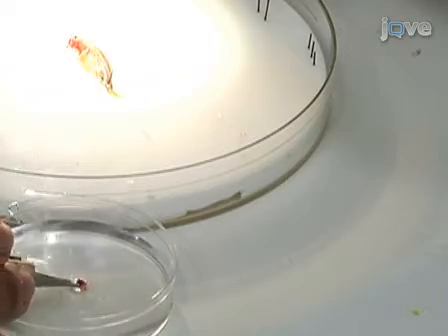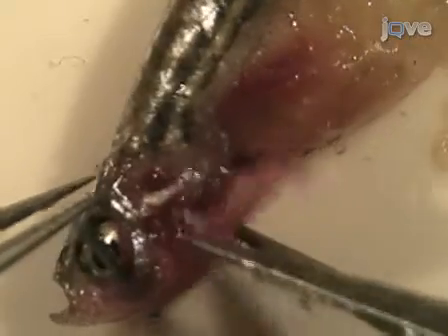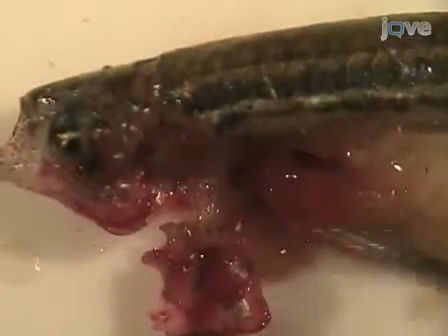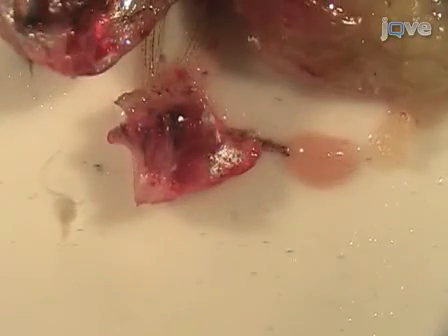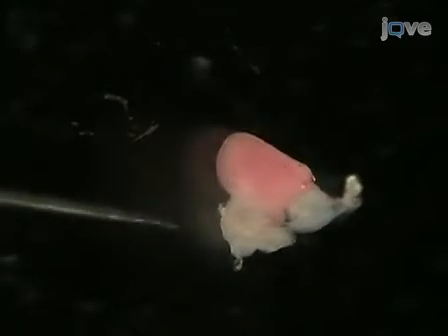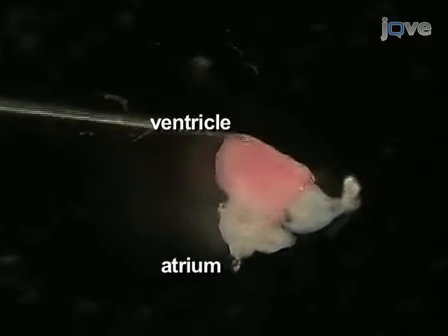Next, dissect the heart from the fish. The heart is located posterior and ventral to the gill. Begin by cutting out the heart and all of the surrounding tissue and placing it in PBS. Under the microscope, gently dissect away the tissue surrounding the heart, being careful not to damage the delicate atrium. Place the dissected heart into Ringer's solution and put it under the microscope to observe the heartbeat. Identify the atrium, ventricle, and bulbus arteriosus.